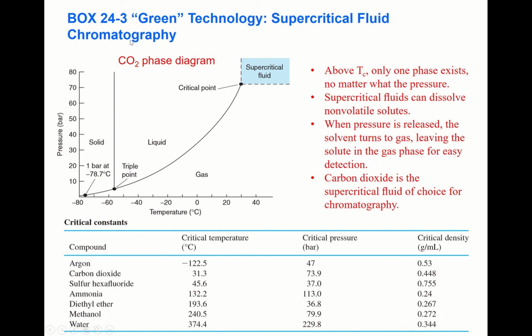With green technology, we can reduce the contaminants. There are 12 concepts of green technology, and supercritical fluid chromatography is one of them. To understand this, you have to know what a supercritical fluid is. This chromatography is done using a supercritical fluid.